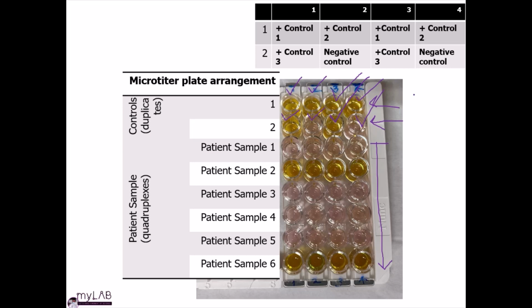For all the positive tests, we get an orange color. This is after adding the stop solution. For all the negative tests, we get a pink color.